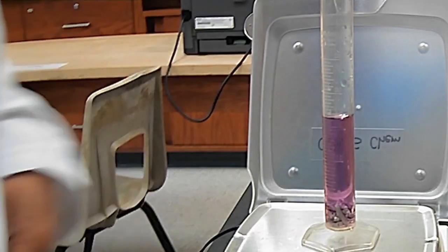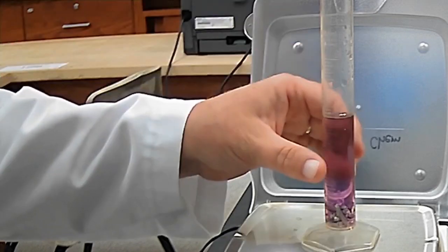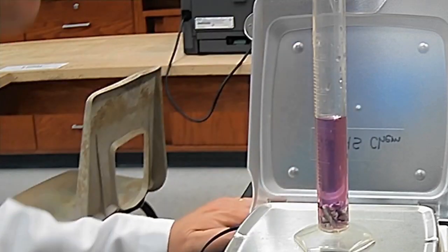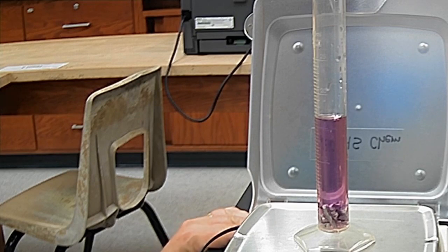So now our new mass is going to be 31.9 grams. Our new mass is 31.9 grams. And our new volume for trial 2 metal A, let me get down here, see if I can see it, is once again, have to get really low here.